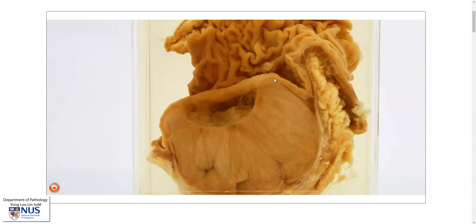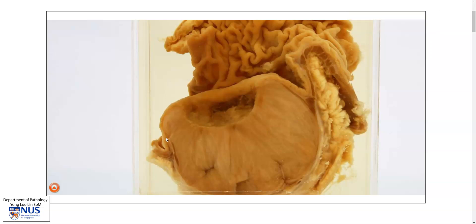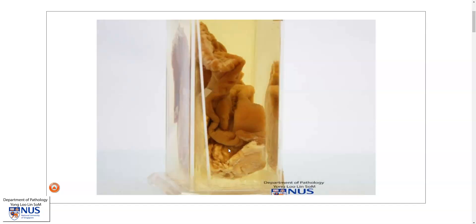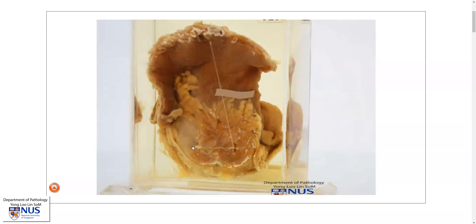It appears to be arising from deep to the mucosa, and this dark brown layer is the muscularis propria, so it could possibly be arising from the muscularis propria. Here we can see the overlying mucosa, which is separate from the tumor. This is the side view where we can see that the mucosa is stretched over the tumor, but it is distinct from the tumor, and this is the serosal surface.